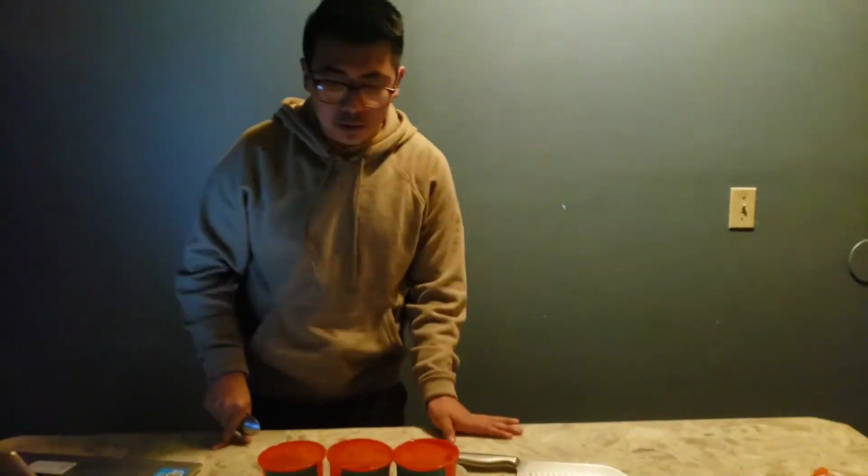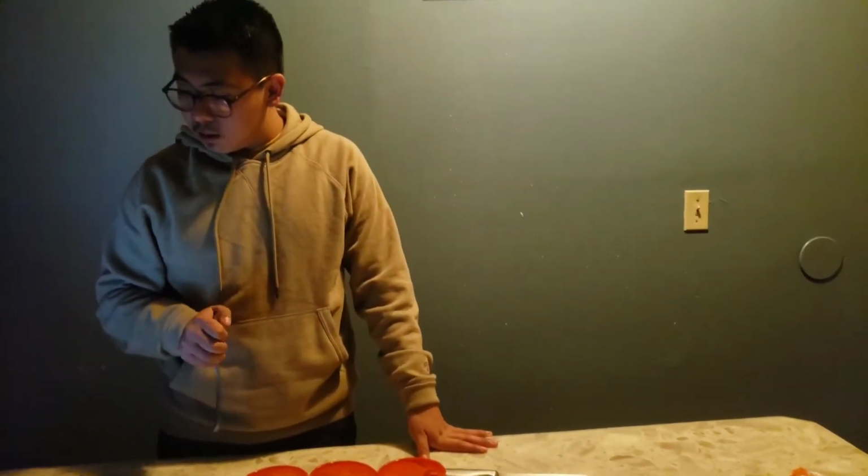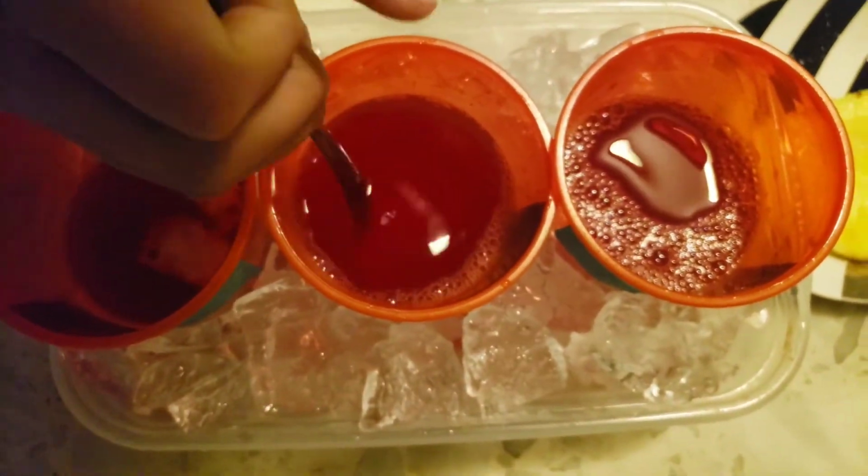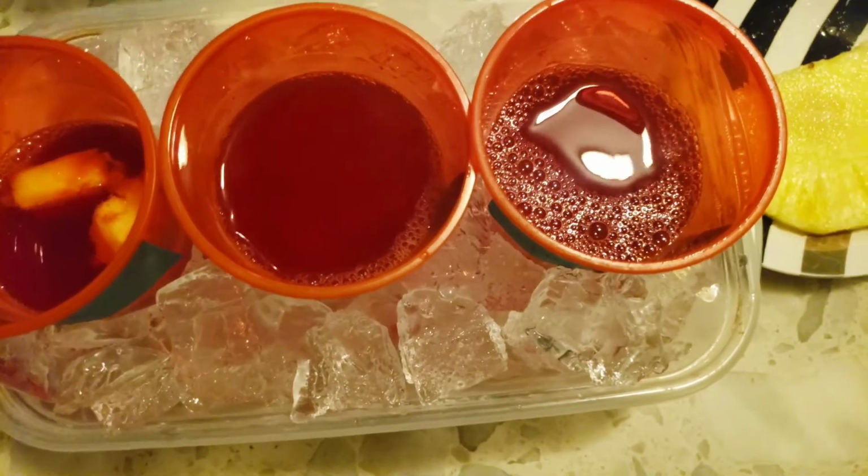So it has been 2 minutes, and now I'm going to be stirring the gelatin inside the cup to check on them. Yeah, the pineapple's all the way at the bottom, and this one remains the same.